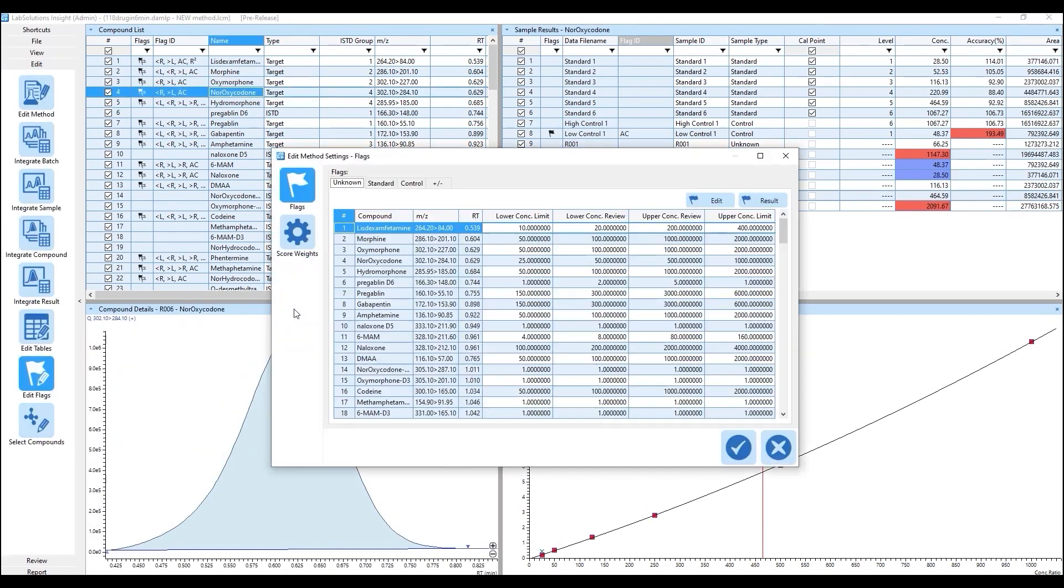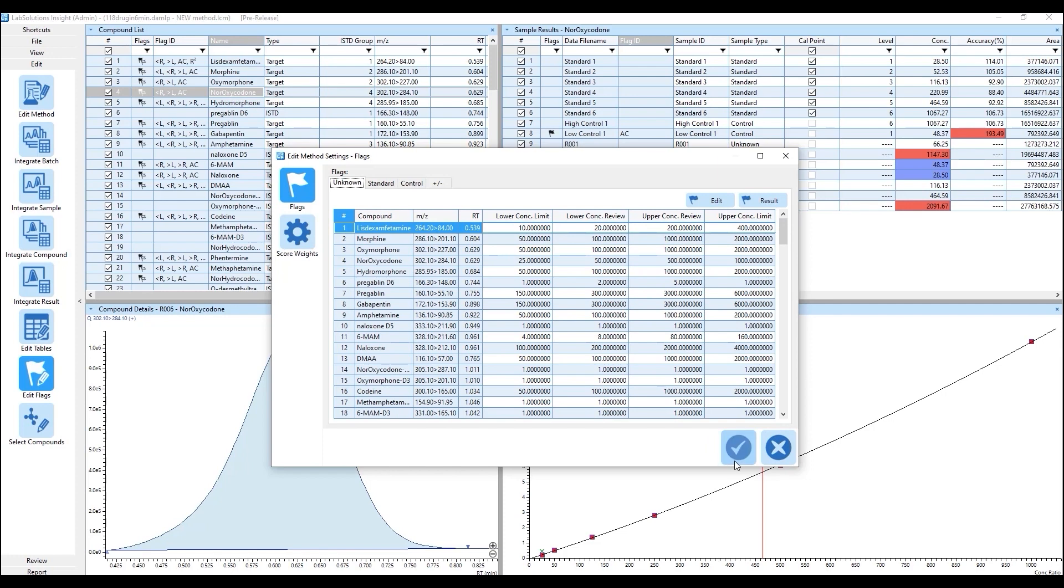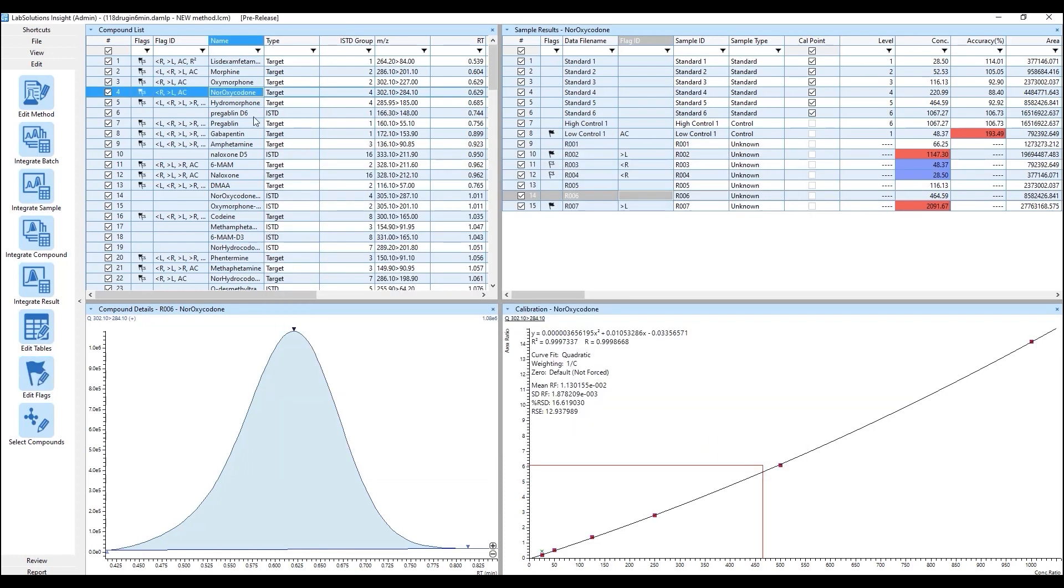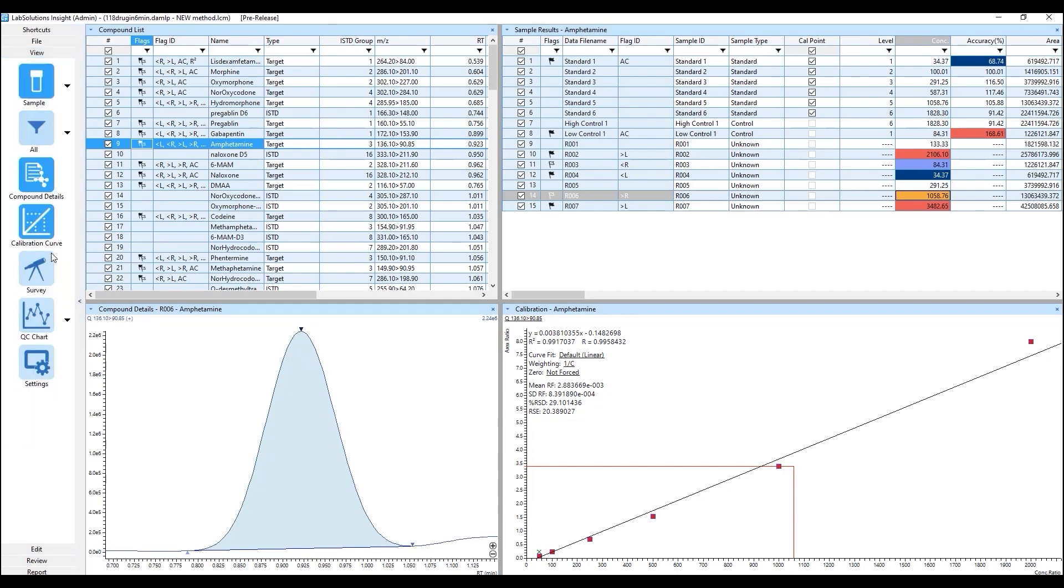The unknown sample type has a lower and upper concentration limit and review flag parameters. Unknown samples with concentrations outside the set values will have different colors.